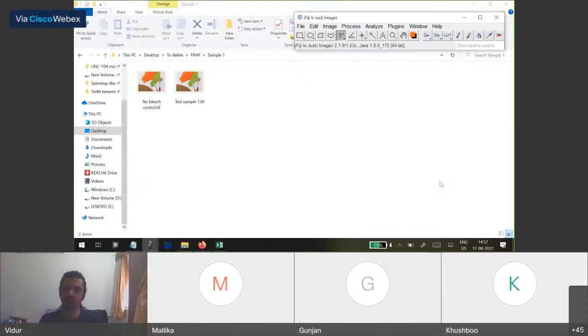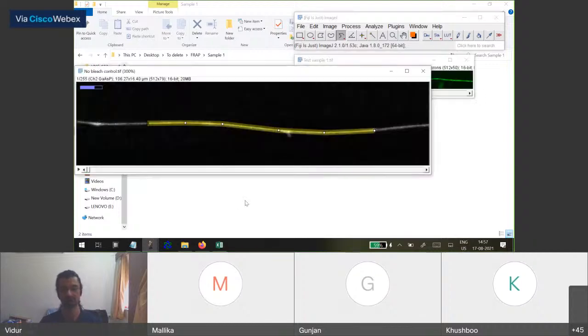Okay. Let me know once you've opened it. It's sample one, sample one, and no bleach control. Someone had some question. I have sample one, sample two, and the equation file. Is there any other? No, that's all. Just these three.